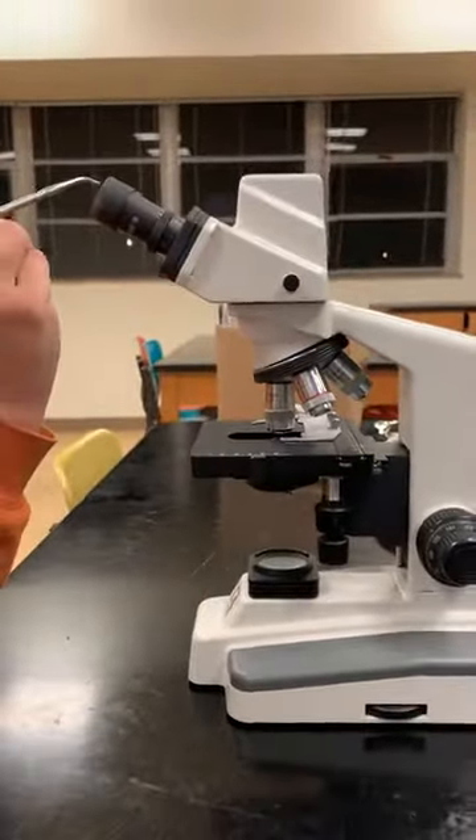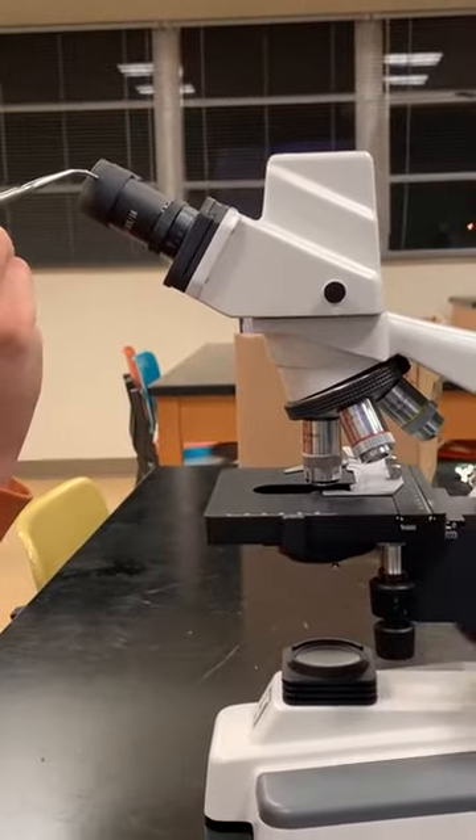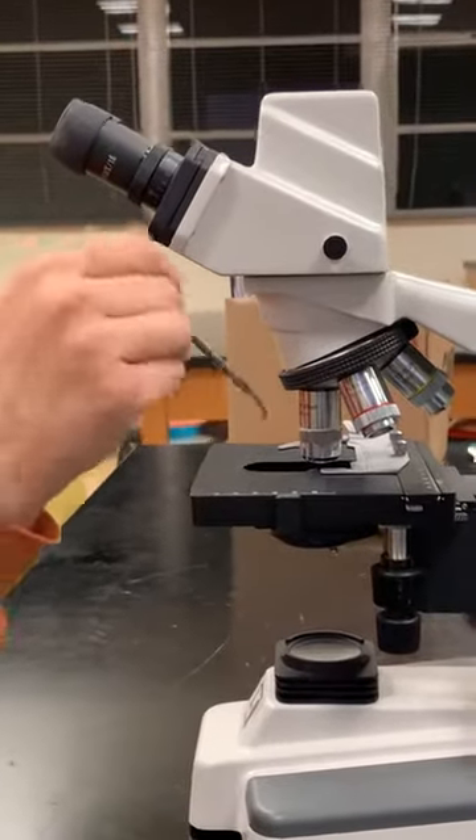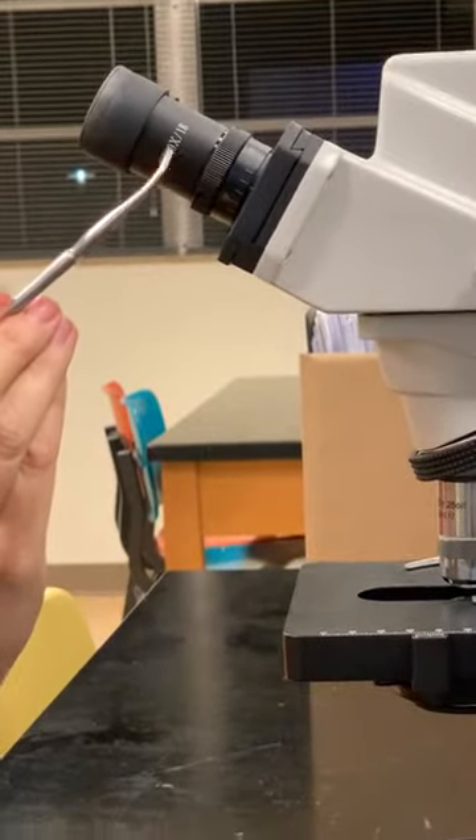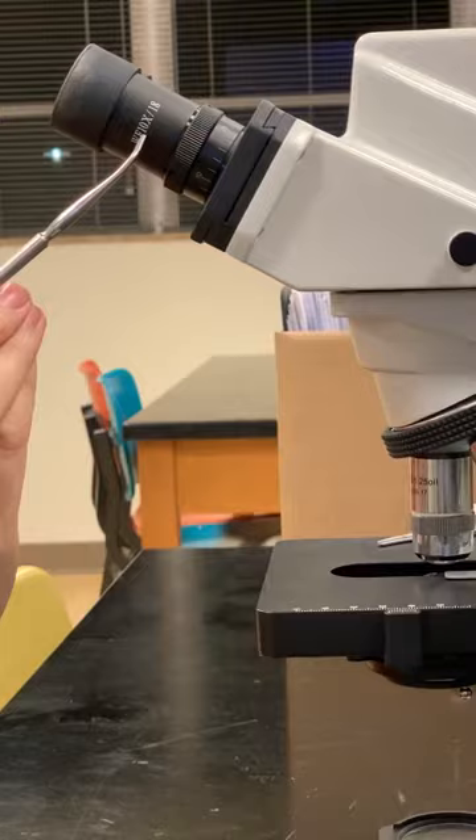When we look at the eyepiece, the job of the eyepiece is going to be to view the slide, and if you look closely, it says 10x right here. It magnifies the image by 10 times.